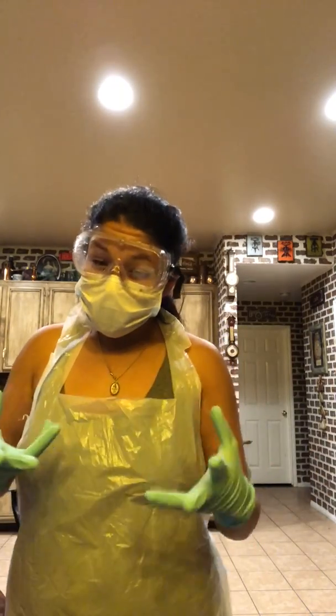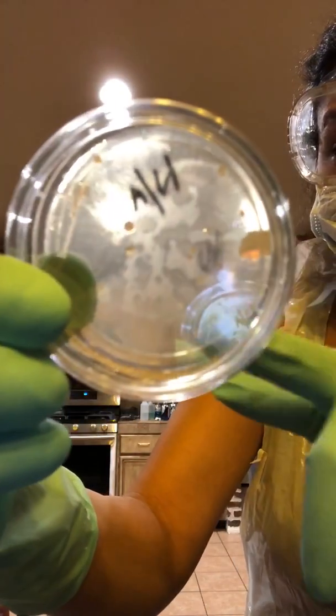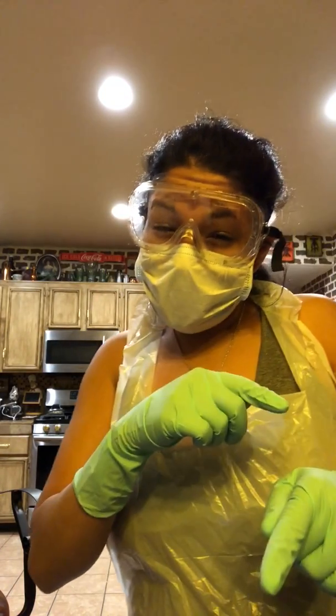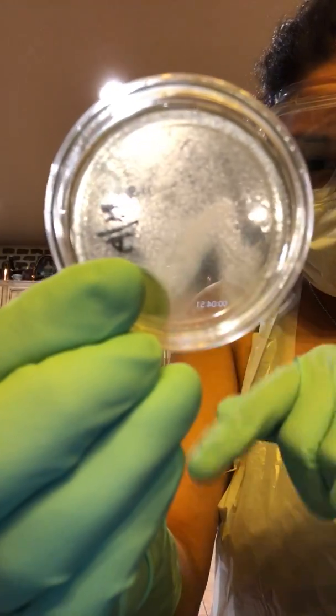What I am going to show you is the plates that came out of it. I'll be showing you yeast 1, and as you can see, yeast 1 has built up. It's just really big. At 12 hours you inverted it, so you had to flip it from right side up to upside down. Okay, so this was the second diluted yeast from the first one.